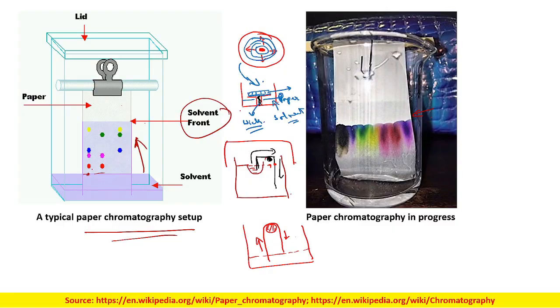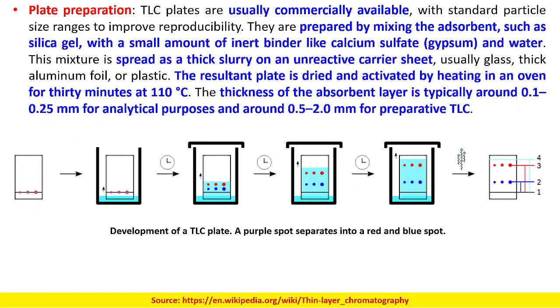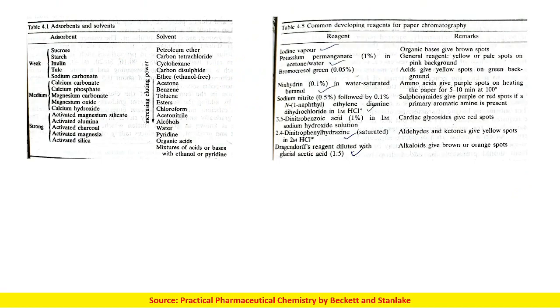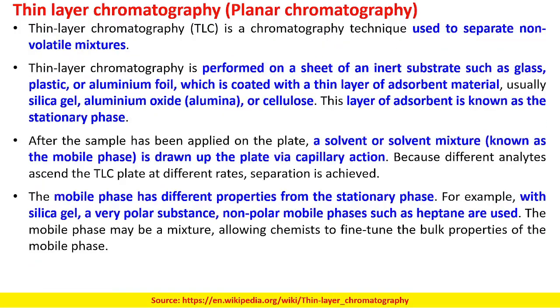Okay, so maybe we can discuss this one at a later stage, or maybe we can also discuss it for 10 minutes at the end. Let us discuss thin layer chromatography. What happens over there in the thin layer chromatography?